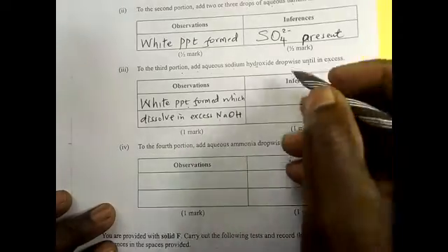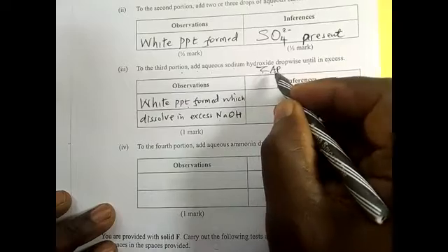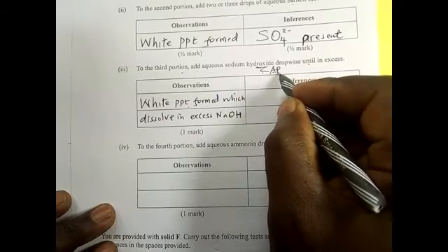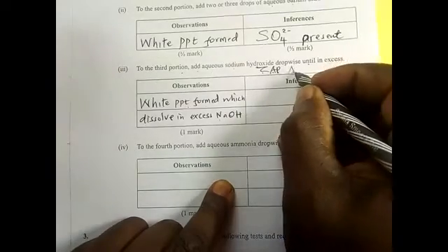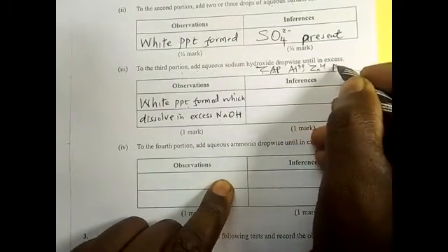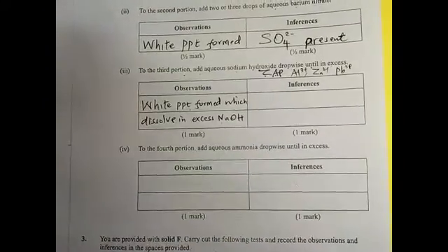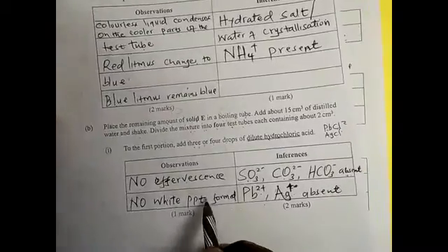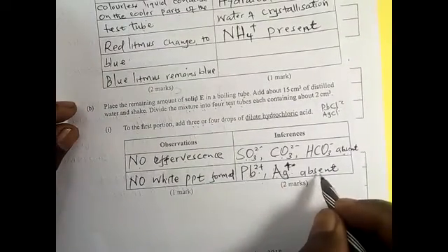So there we expect the ZAP ions: the zinc, aluminium, and the lead. We are supposed to write all of them: aluminium, zinc, and lead. But in our previous inference in Roman 1, we have said that lead is absent.